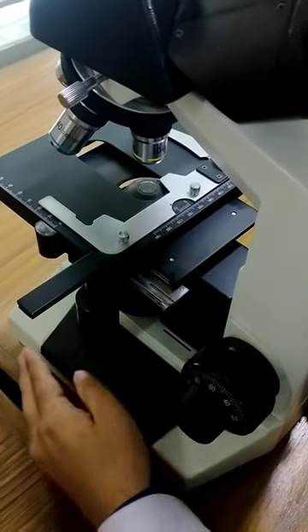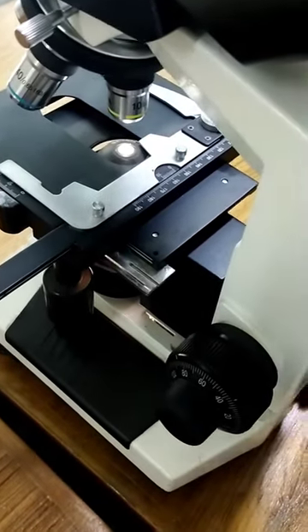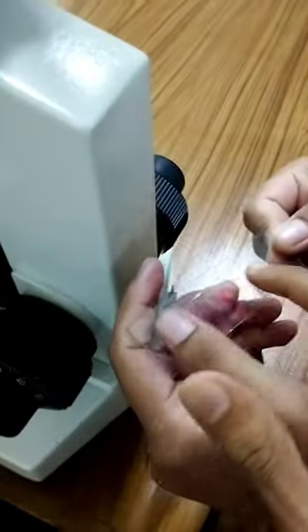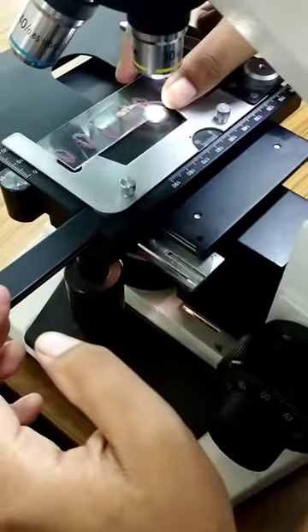The objective lens is 10x. The light is on, but the slide is a light on. The slide is a light on. The light is on — it's a cover slip. Then place it.